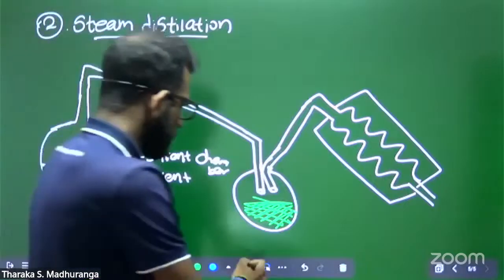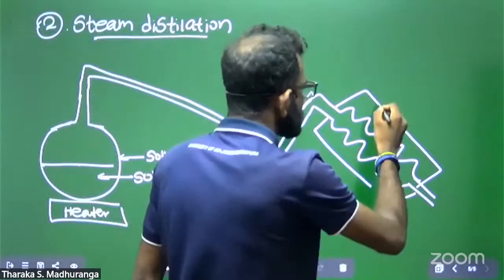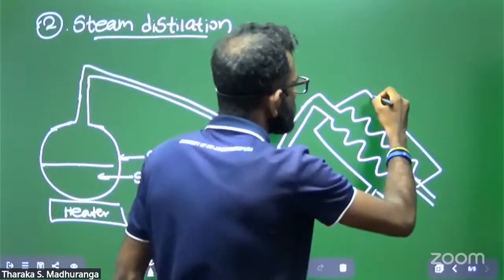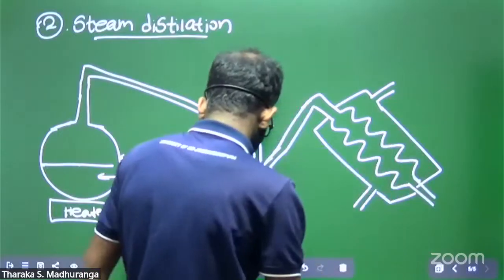Then this is the water in line. This is the water outlet. This is water in.